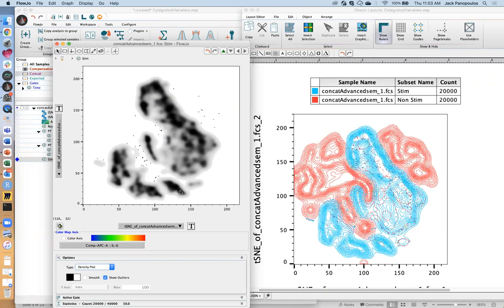Maybe not as obvious in this population of cells that are elongated in this section, but who knows, maybe this population over here that makes the foot is different than the one at the top of the head. In some of the other bodies over here, you can clearly see that there are dark patches separated by white space or a little bit less dense areas. And these can be, again, those little nitty gritty populations that might be more or less different from one another.